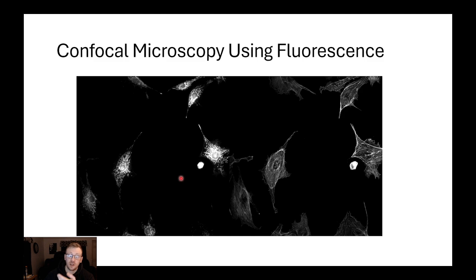And I'm seeing intracellular mechanisms of the cell. And what you can see is we get a really dark background. We get a really bright light. So again, we've achieved a really high, strikingly different contrast in appearance by using a fluorescent protein.